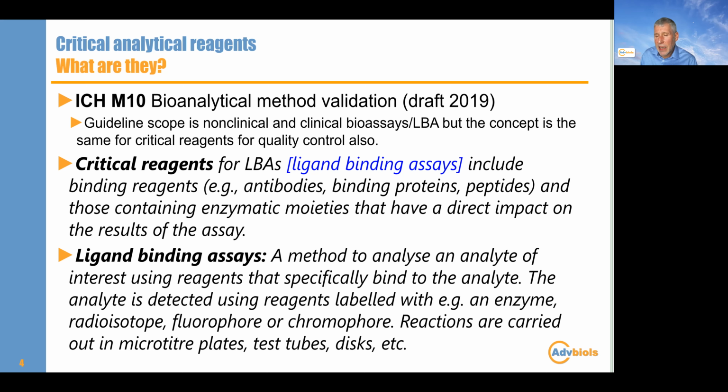So if you're looking at a low-level antigen, say by flow cytometry, then distinguishing a positive from a negative can be quite tricky unless you've got a good signal to give you a clean positive and negative. Also looking at rare events, if you make CAR Ts and you want to check that there's no B-cell lymphoma left in the CAR T, for example, then you might be looking at fairly rare events. Or if you're looking for an iPS, but actually we're talking about gene therapy, so let's not drift too much into that, but they're easy ones to think of.